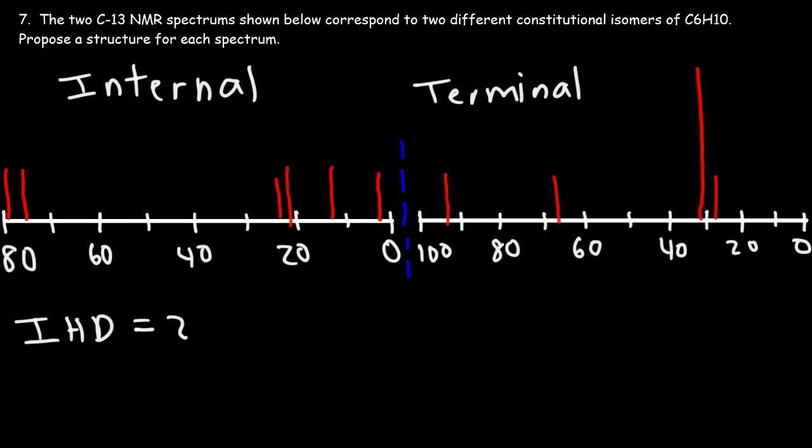So alkynes can range between 50 and 100, but as we said before, typically it's 70 to 100, but sometimes you'll see some that are less than 70.